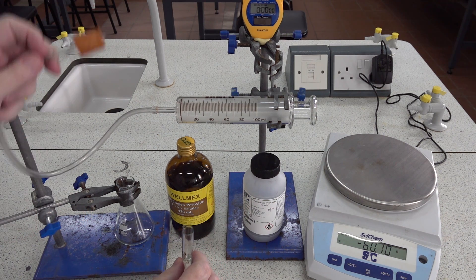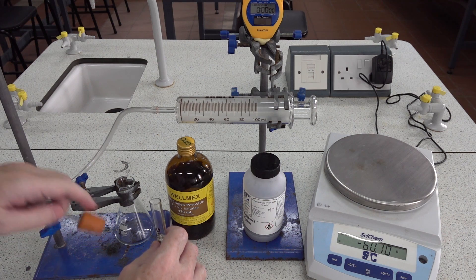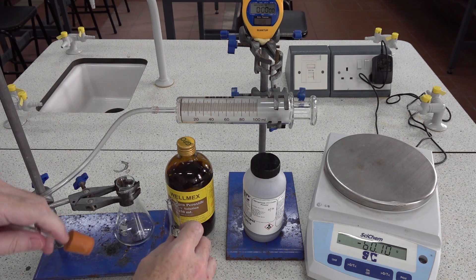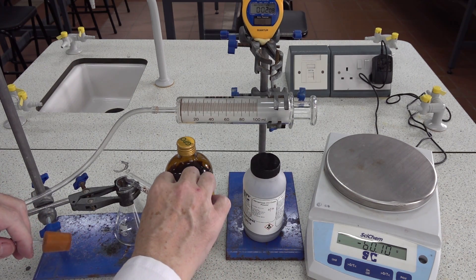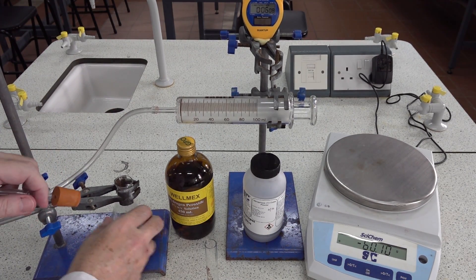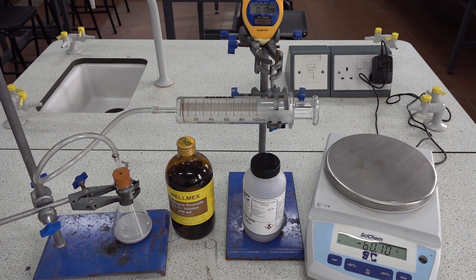So although this method is flawed at the start, it has the advantage of keeping the solid, which may be hazardous, where we want it. So here we go — let's start the clock, add the hydrogen peroxide, give it a little shake.